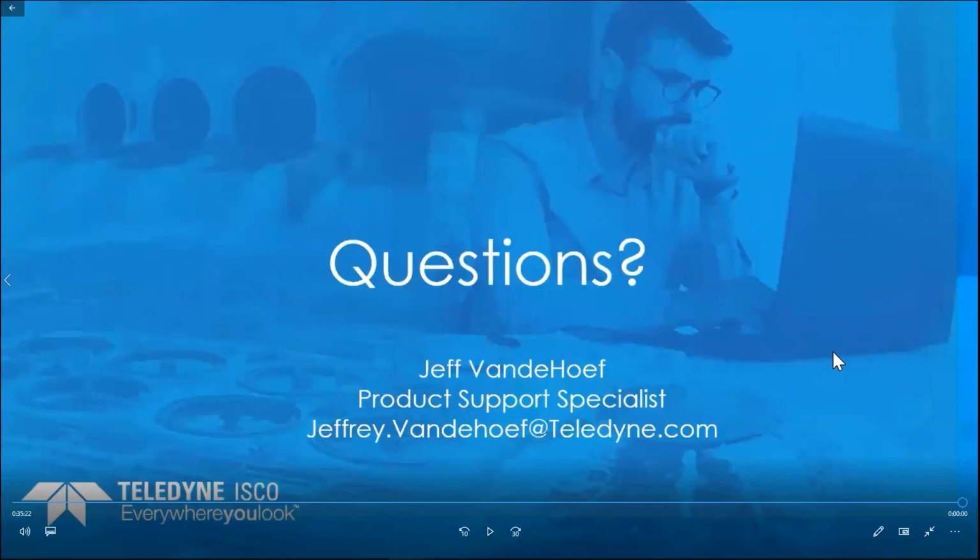Thank you for providing that phone number, Jeff. We have another question. How does a sampler adjust the sample volume when calibrating the unit? If I input a volume after calibrating, it seems to always overcorrect.